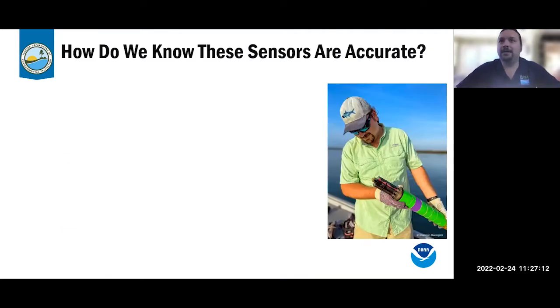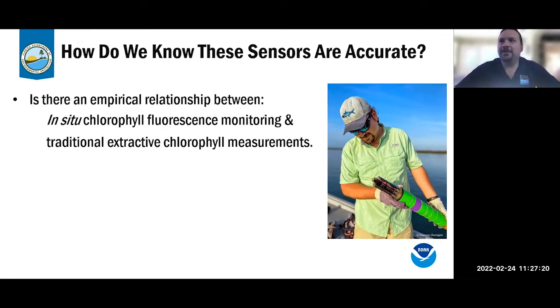So how do we know that these sensors are accurate? This is actually a picture of me asking myself that question. Our fundamental research question was, is there an empirical or validatable relationship between in situ chlorophyll fluorescence monitoring and traditional extractive chlorophyll measurements?